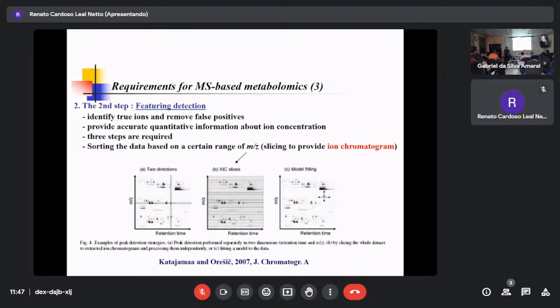And also, one of the reasons why I have to use this is to save data size. If you have too many dots, the data size is too big. If you remove these, it's not that big.